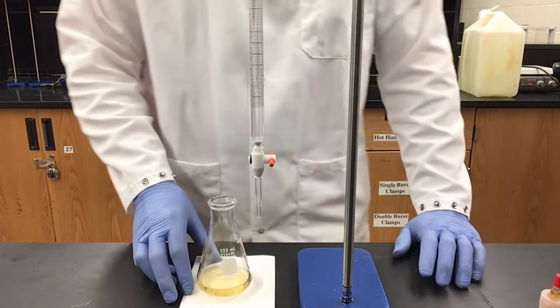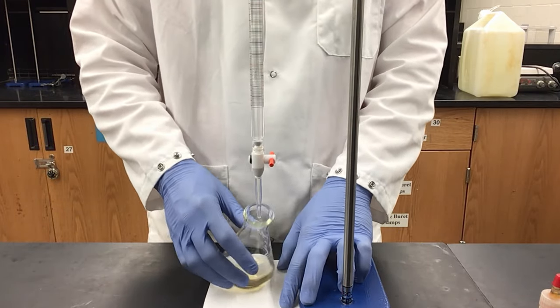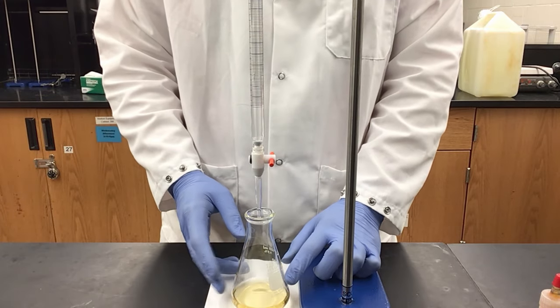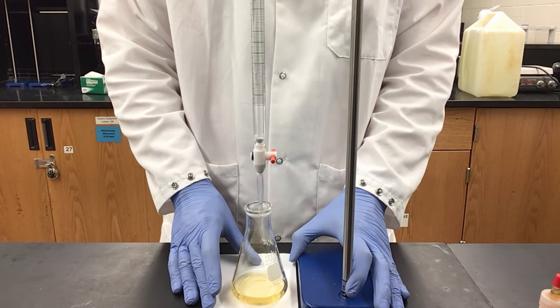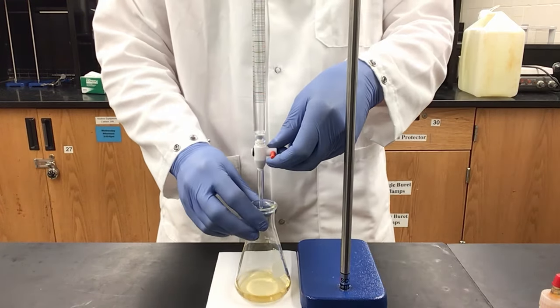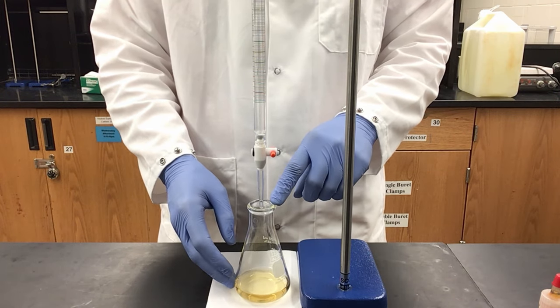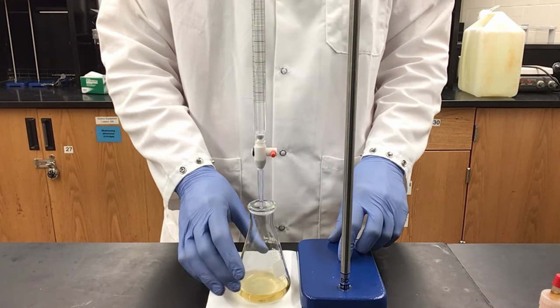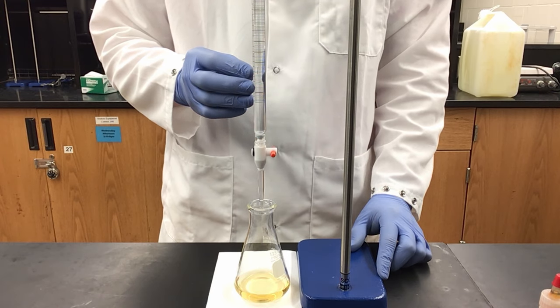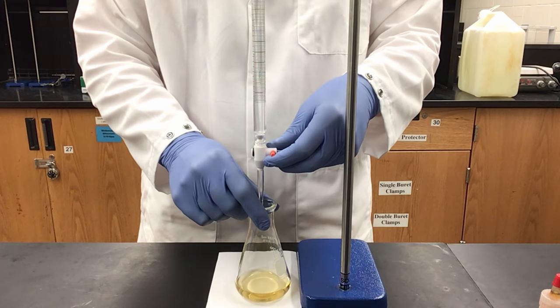Now we are ready to titrate with our 0.1 molar sodium hydroxide. Since we are using thymol blue, we are looking to titrate until we get a green color — we do not want blue, as that means we have overshot our endpoint. We have calculated that we have 0.003 moles of acid in our flask, so with a 0.1 molar solution we expect to use around 30 milliliters of sodium hydroxide.